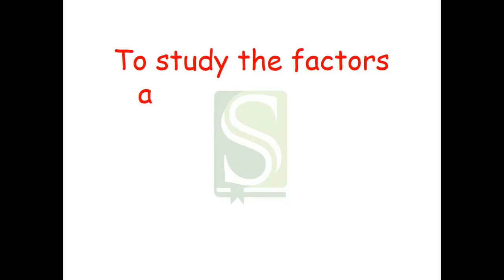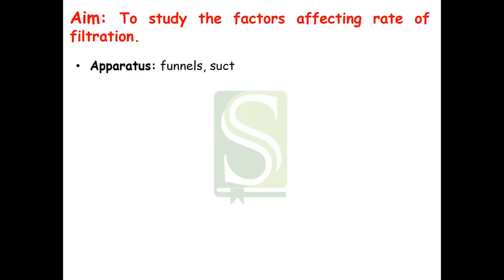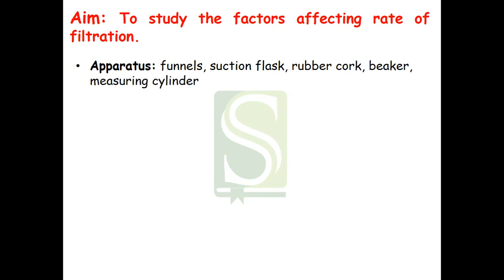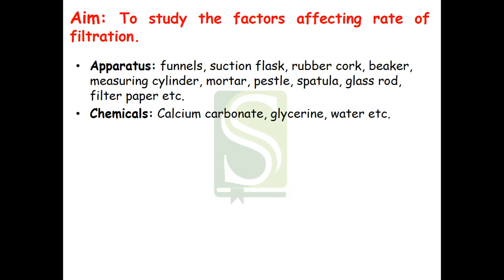Welcome students. Today we are going to see the performance of the practical to study the factors affecting rate of filtration. The requirement for this experiment is, in apparatus, we will require funnels, suction flask, rubber cork, beaker, measuring cylinder, mortar and pestle, spatula, glass rod and filter paper. In chemicals, we will require calcium carbonate, glycerine, water, etc.